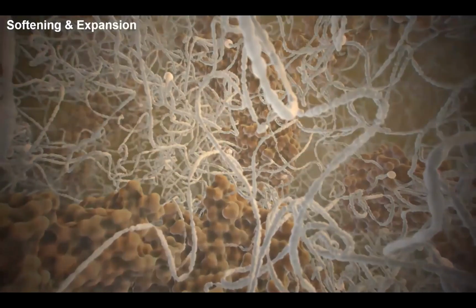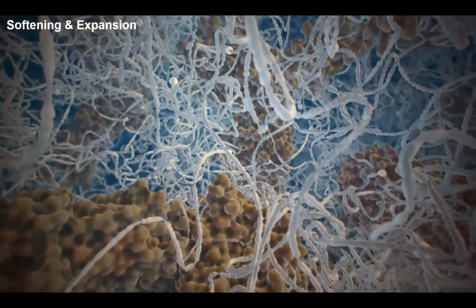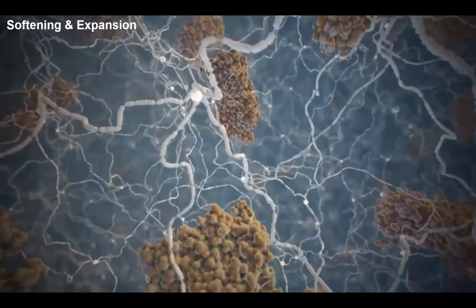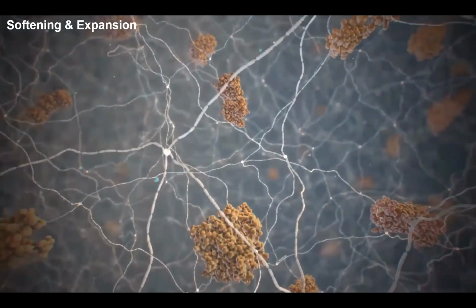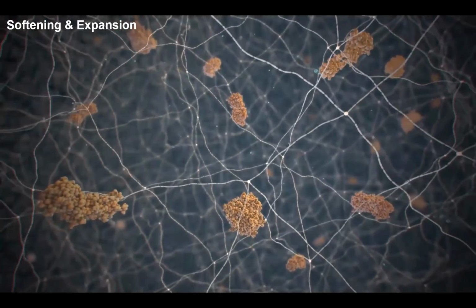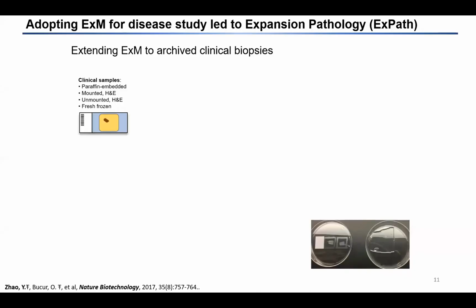And after that, you can apply enzymes or heat denaturation to loosen up the tissue. And then you place the tissue gel inside pure water. Now, everything is expanding, and these biomolecules are separated from each other while maintaining their relative shape and geometry relationship to each other.